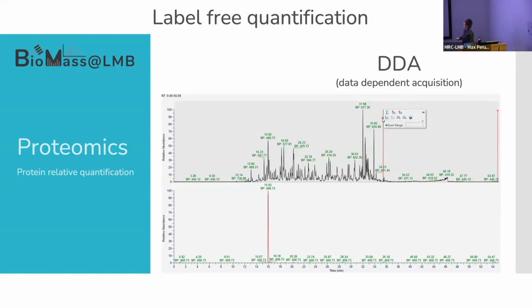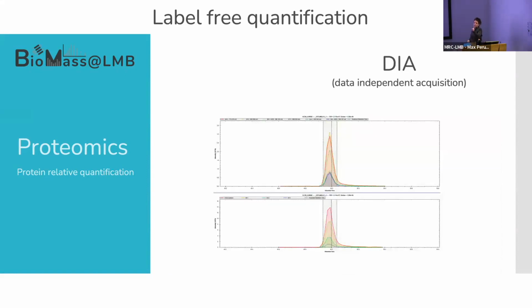So this is how the quantification is made. On top, you can see a chromatogram. You can see everything that went inside the mass spec. All those peaks are peptide signals, basically. Then the software does extracted ion chromatograms, and you can either use the intensity of that peptide, or you can use the area of the whole integration of the extracted ion. That's the signal for one specific peptide. In this case, you can see the mass here that has the signal for that specific peak. So what you're quantifying, even though you have MS2 data, is at the MS1 level.